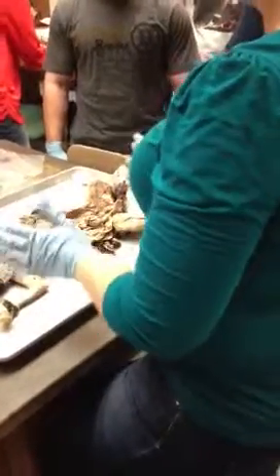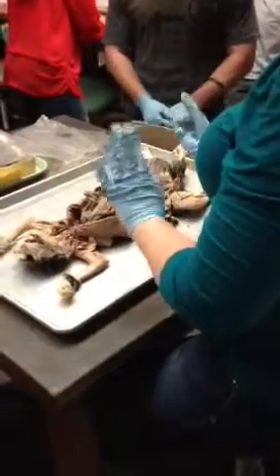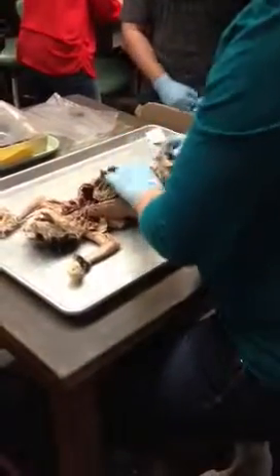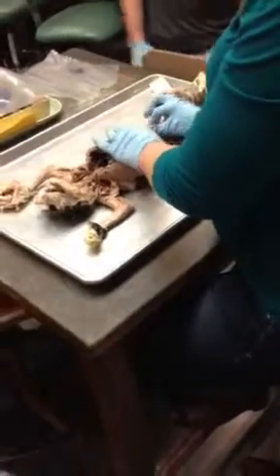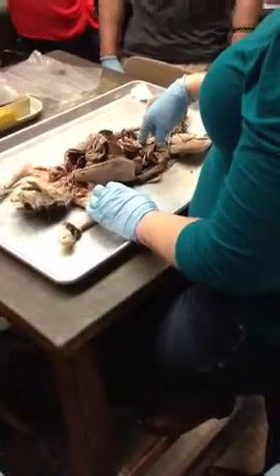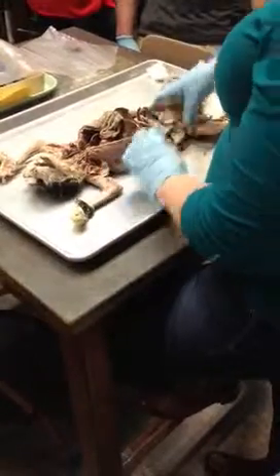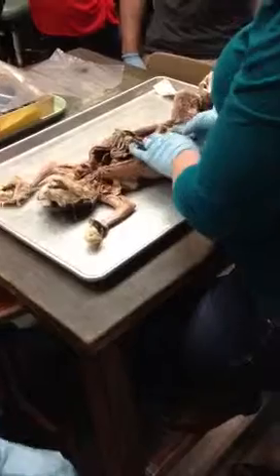In regards to the small intestine, don't worry about the ducts. Know them for the human, not the cat, okay? In regards to the regions, if I'm up here near the stomach, I'm in what region of the small intestine? Good, okay? If I have a pin in the center here, where you really don't see either end, jejunum, good. And then down here, where you can clearly see the large intestine and small intestine would be ileum, good.